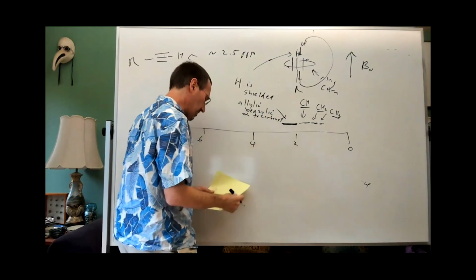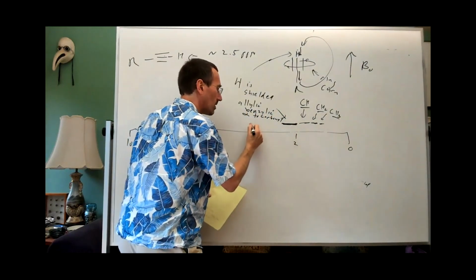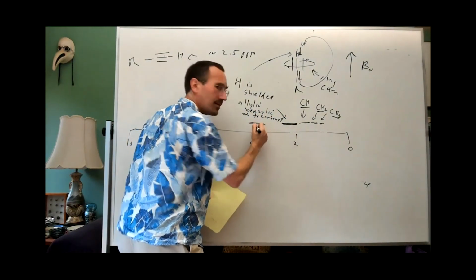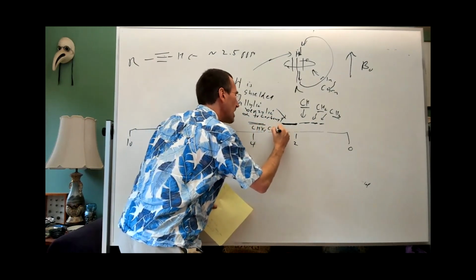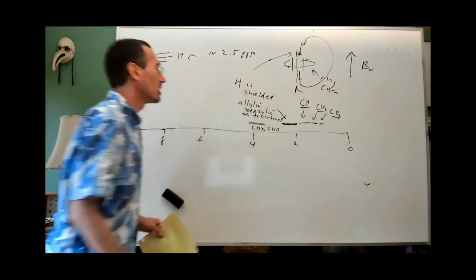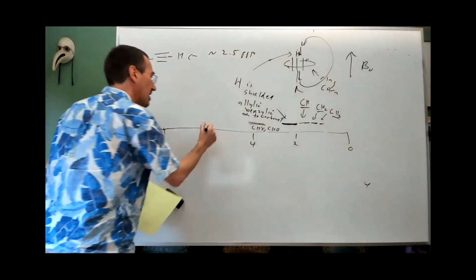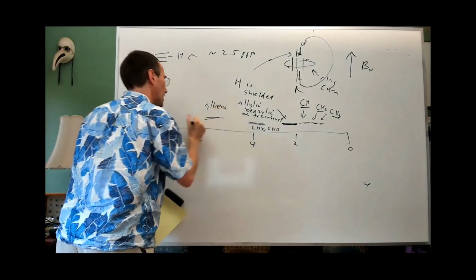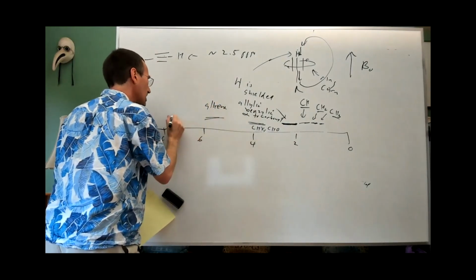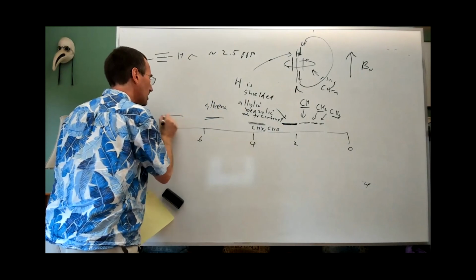Moving a little further downfield, over here, I think of CHX, CHO. Moving further downfield, I think alkene. I think arene over here.